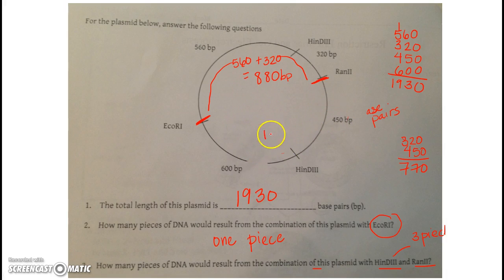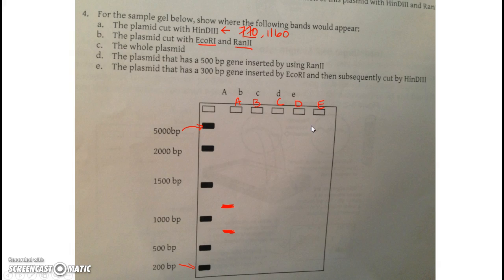All right, and there's no other EcoR1 or Ran sites, so we're going to add 600 to 450 here, so that's 1,050 base pairs from here to here. Okay, so we're going to get those two pieces, 880 and 1050. All right, so that's going to go into lane B. 880 is, well, that was 770, so I imagine 880 would be a little bit higher, and 1050 is even higher, kind of like right there.